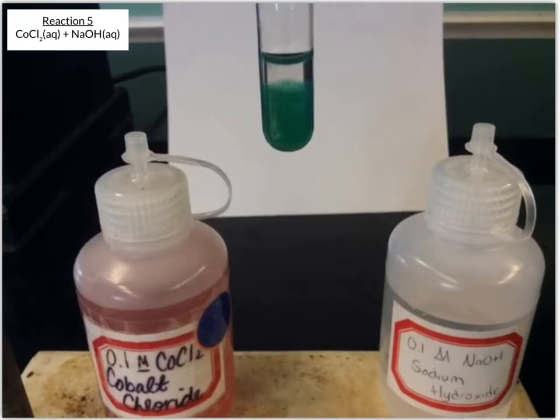Okay, so I've given it several minutes and you can see that it's settling. It's still in the process of settling, but you can tell that there's some solid there. It's this greenish blue turquoise color solid that's now settling to the bottom. So this definitely was a precipitation reaction that occurred between the cobalt 2 chloride and the sodium hydroxide.